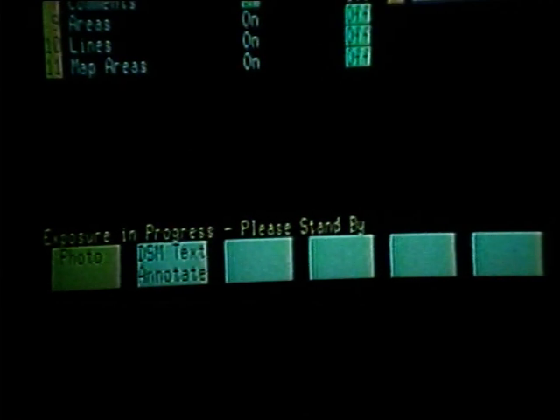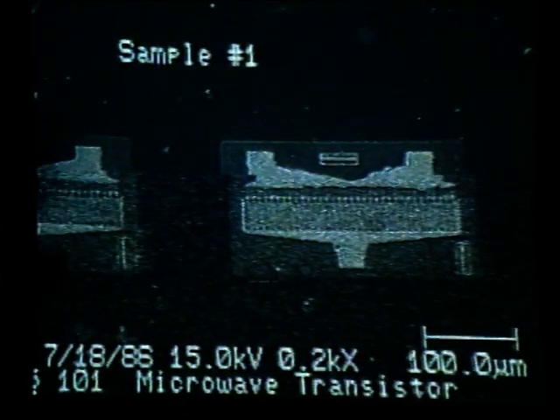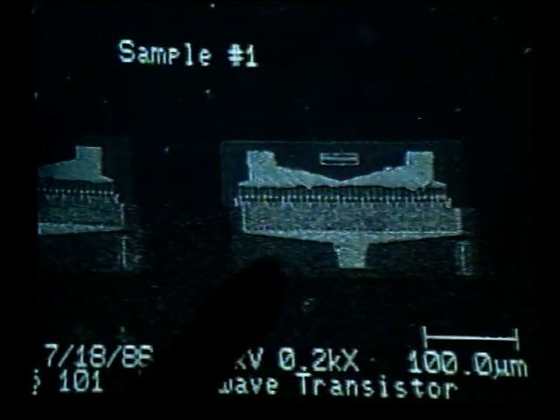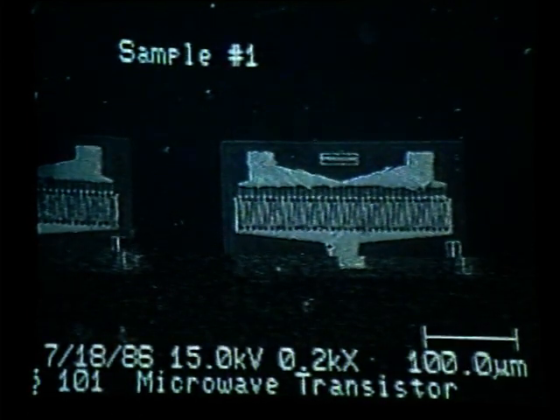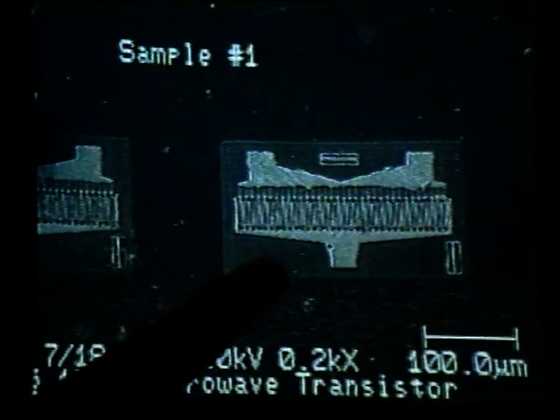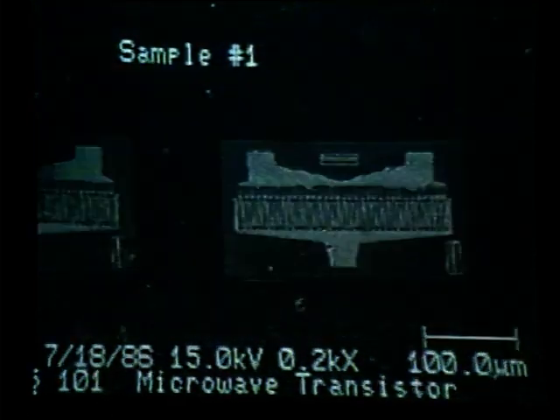If we were to look at the TV at this time, we would see that our live image has been frozen, but it is being replaced with the high-resolution TV image. This is now the photograph that we will receive. Notice much sharper features as we scan slower.